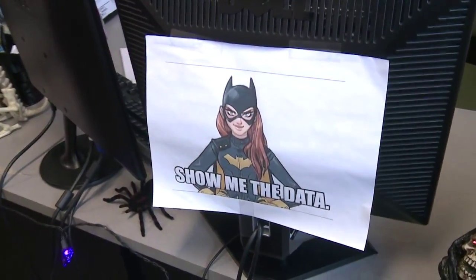But do you translate numbers into words somehow? No, we just give them the numbers. But what meaning will it have for them? If you looked through this, you'd see the symbol for arsenic, but what do these figures mean? They send their samples and say, we want you to make sure the arsenic is below however many parts per million. So when Jess enters that result, it's put into the lab report so it makes sense to them: yes, we did test the arsenic; it's below the level that you wanted.